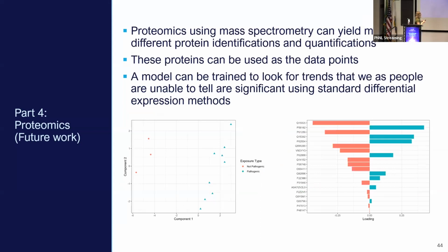So the next part of this project is to look at proteomics data, which is much more my wheelhouse, as I primarily work with mass spec data in my day-to-day.